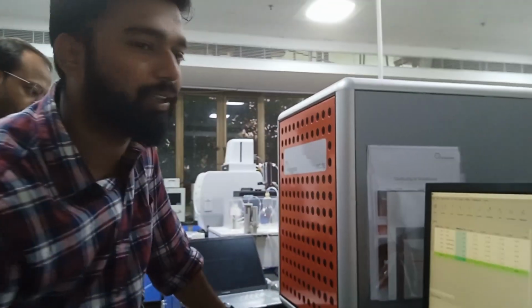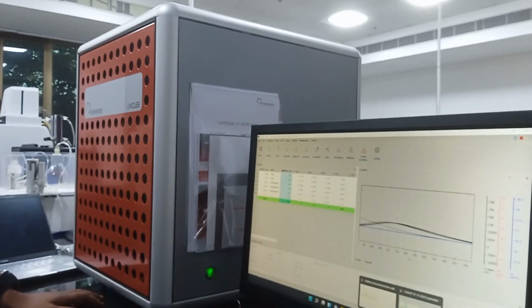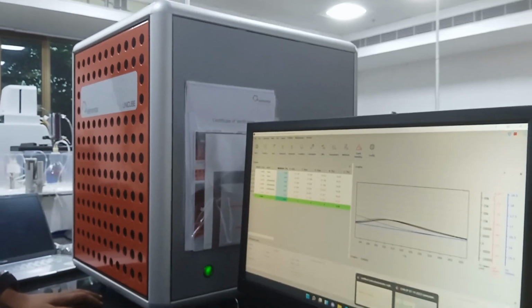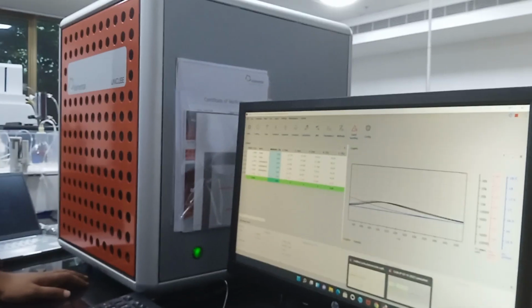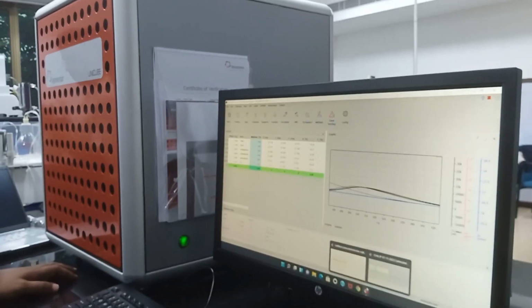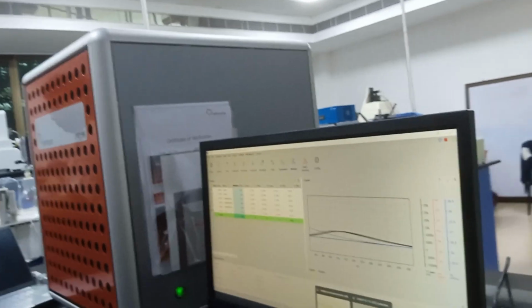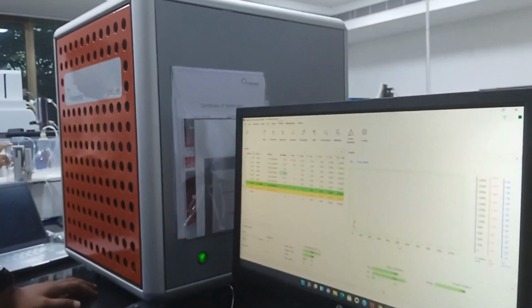No, not like that. I don't know how they calculate the moisture percentage; I think there are different steps to find out the moisture from an element. Still, it is there. So you can enter the moisture percentage, and it will give the exact result.